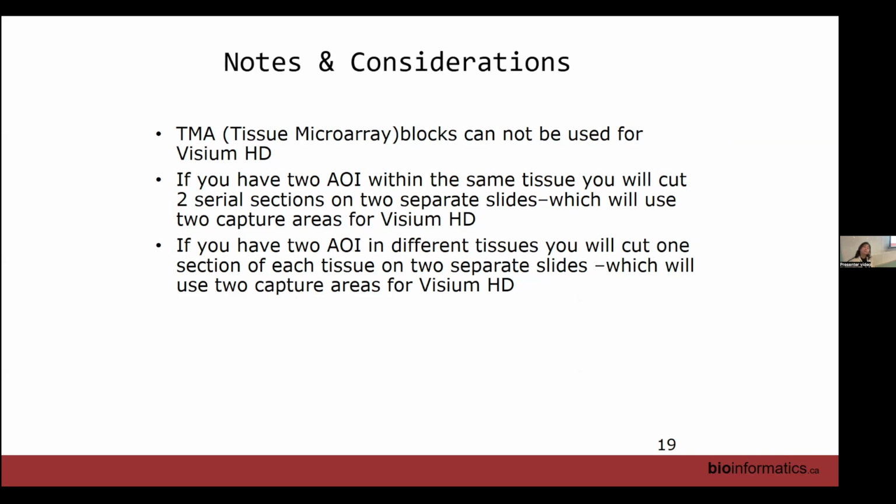So with the wax, do you use fresh wax every time you're switching to an RNase free sample? Yeah, so when we're doing the molds, there's actually a big wax dispenser. And that dispenser, no one touches it. You just put wax in there and it's covered. And we use fresh wax each time we make a block. And so then we just need to specify that when we are putting in the order request form. No, it's part of it already automatically. Yeah. Thank you. But you would put that you need RNA, DNA free sectioning.